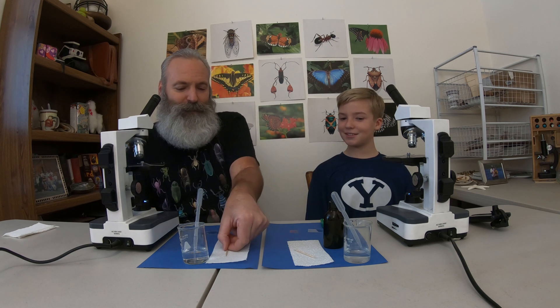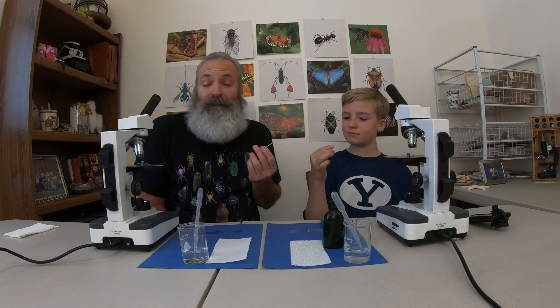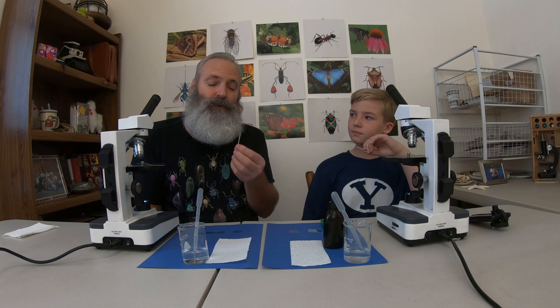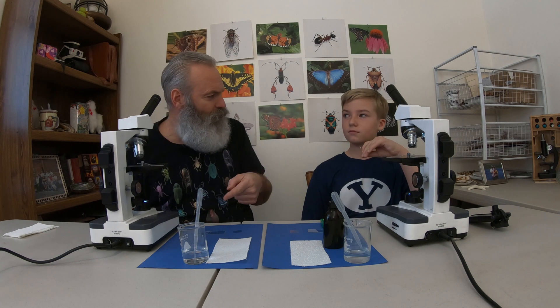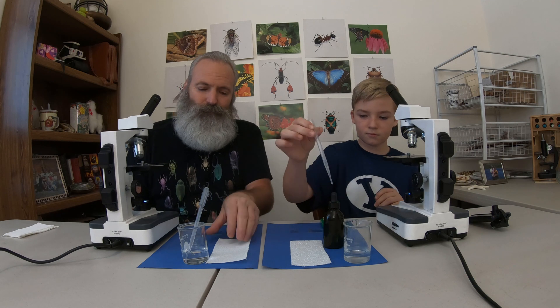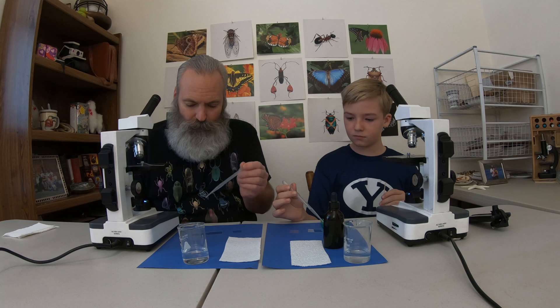We are going to take some of our own cells and extract them. That's not actually an extraction — we're just scraping. There's a whole bunch of cells that fall off the inner lining of our mouths, and we're just collecting them. So we're going to scrape gently with a toothpick. It's important to know we're not piercing but scraping. Let's put a little drop of water first on our slide — we have a clean glass slide and a cover slip, a paper towel, and some water in a dropper.